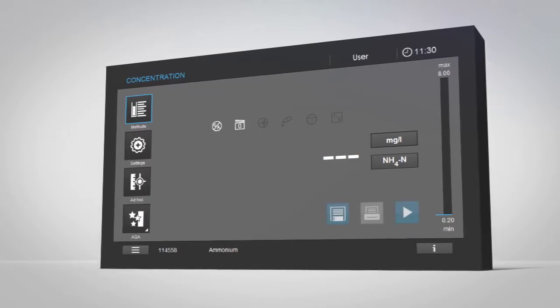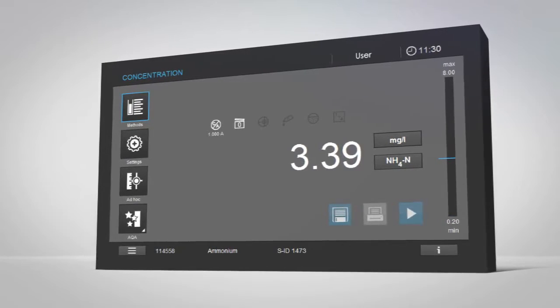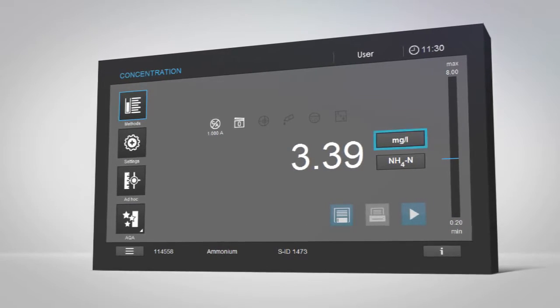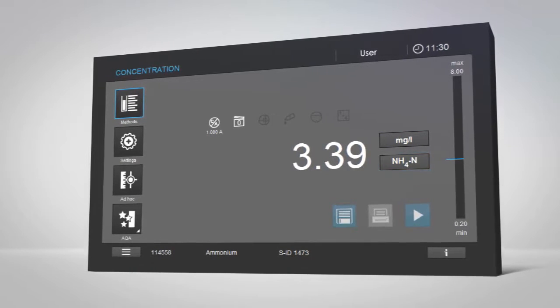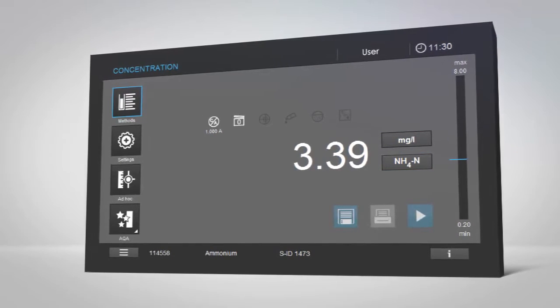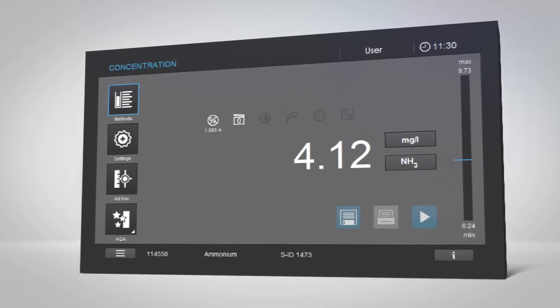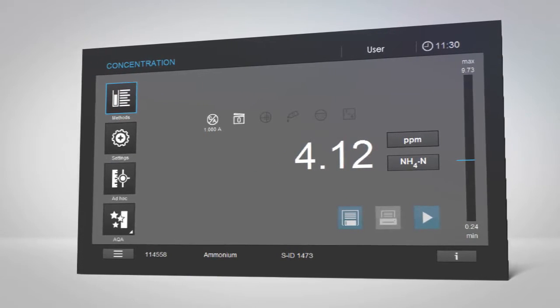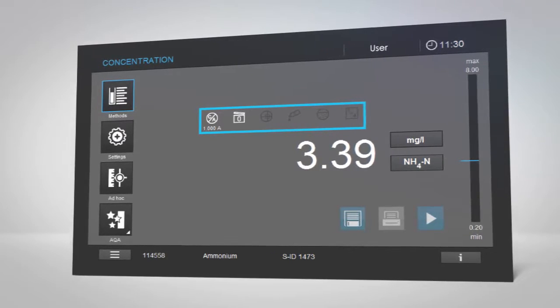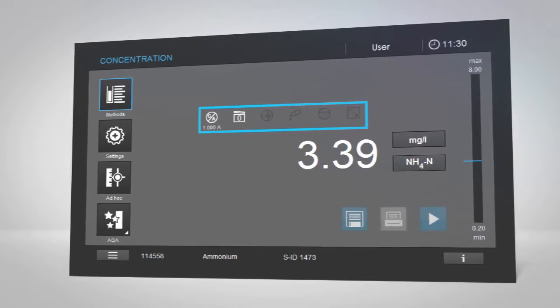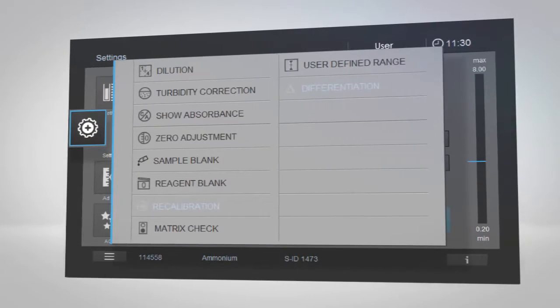The measurement result is displayed in large, easy-to-read characters. Next to it, you will find the unit, such as milligrams per liter, and the citation, for example NH4-N. You can easily customize these by tapping the unit or citation button. The icon bar above the result displays your personal settings, which can be easily adjusted through the settings menu.